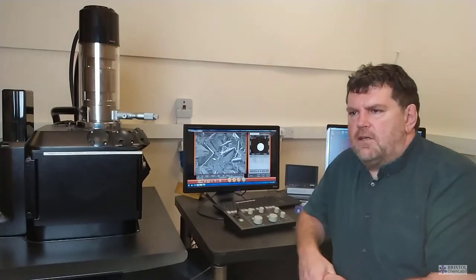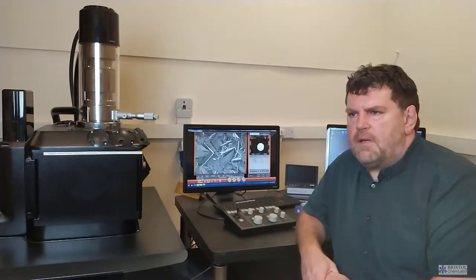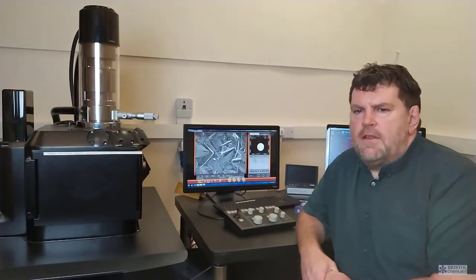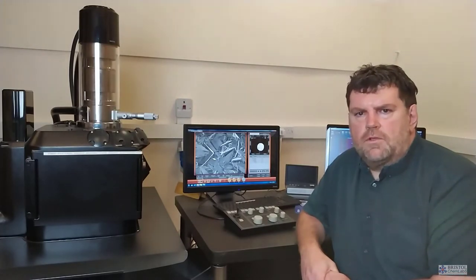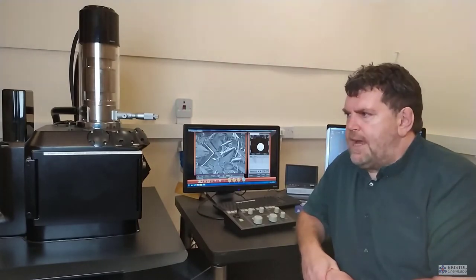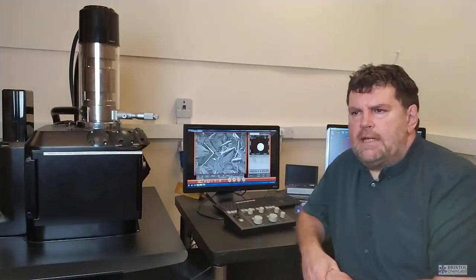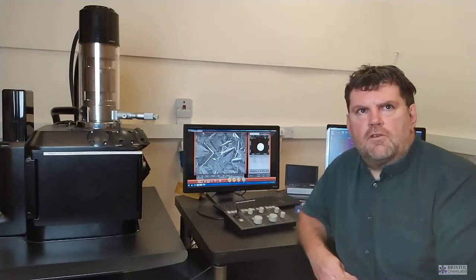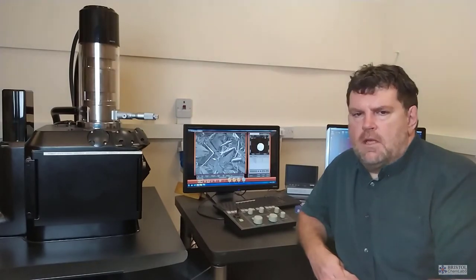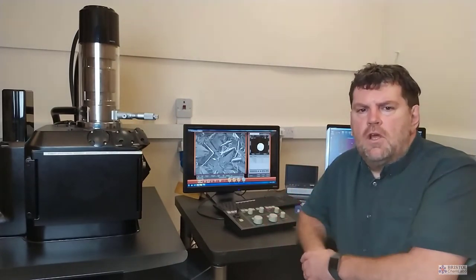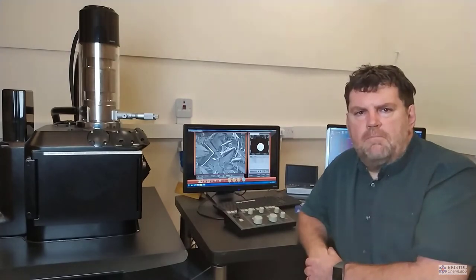We are relatively unique in terms of having an imaging facility with this number of instruments based purely within a chemistry department. At the University of Bristol, in other departments like physics, medicine, engineering, they have their own electron microscopes or atomic force microscopes for the research they're particularly focused on. Within chemistry, we have the appropriate microscopes to support the range of research and by association, the range of research projects available to undergraduates within the chemistry department. That for us ranges from hard materials like diamond right through to softer polymer and biopolymer materials.